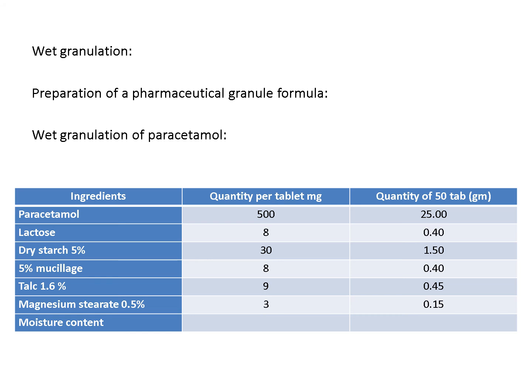So if we add half the amount of dry starch outside the granules, that will transform the tablet into granules, and if we add the rest of the dry starch inside the granules, that will transform or disintegrate the granules into fine powder, and dissolution and absorption will happen and bioavailability is achieved.